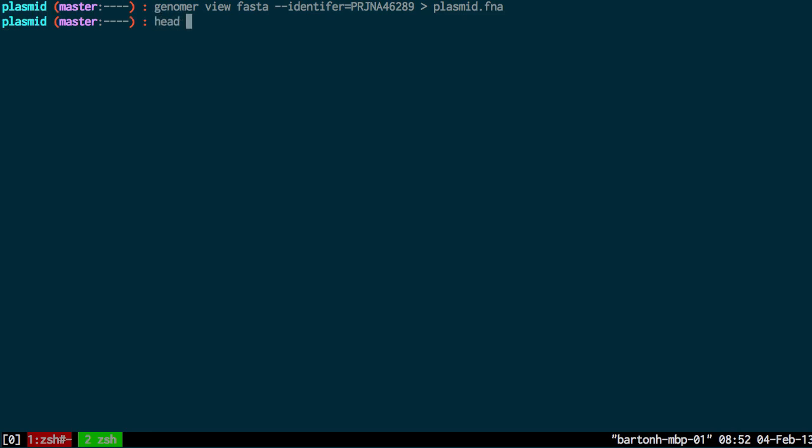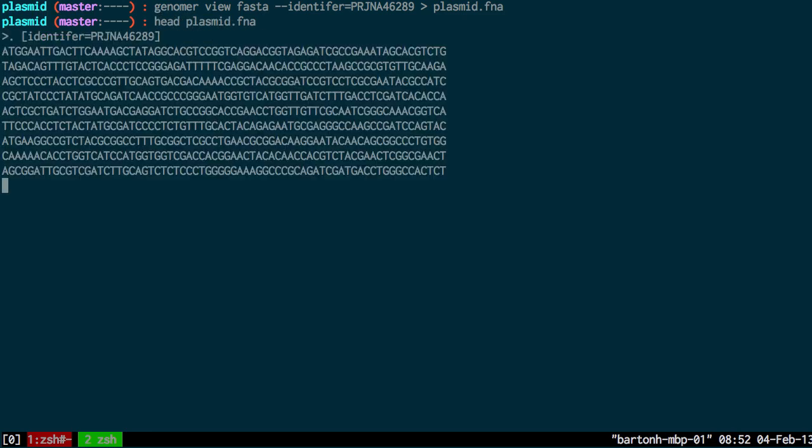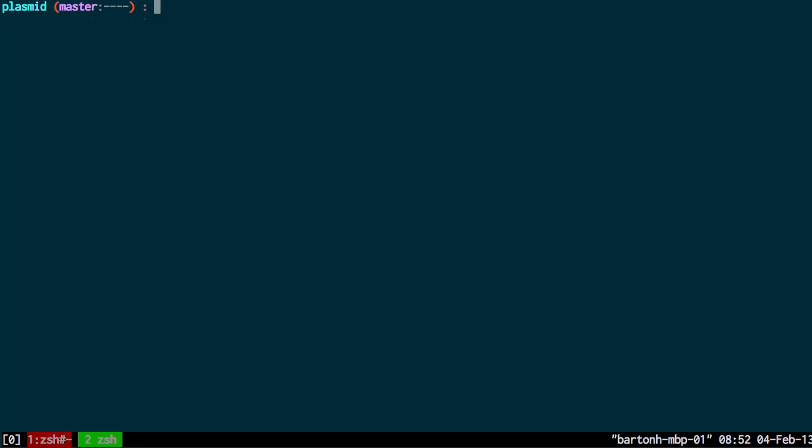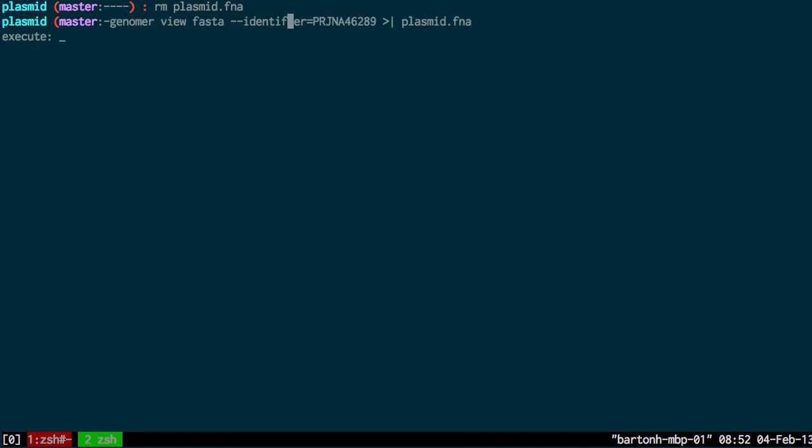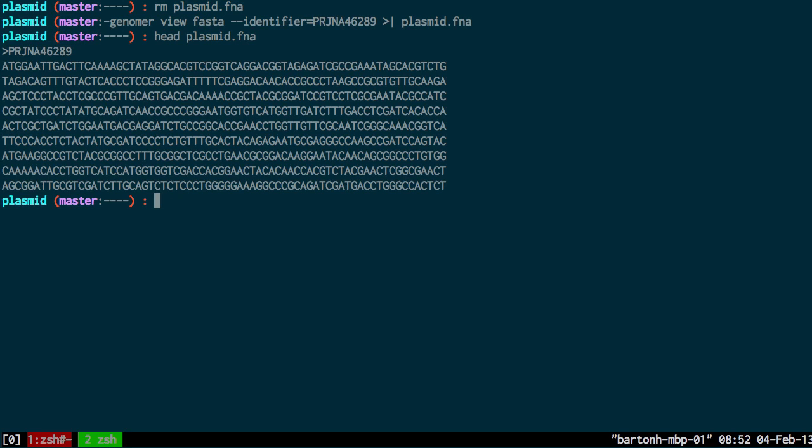If I show you the top of that file now, you can see, oh, typed that wrong. This should have worked this time. Yeah, so here's the identifier for that sequence.